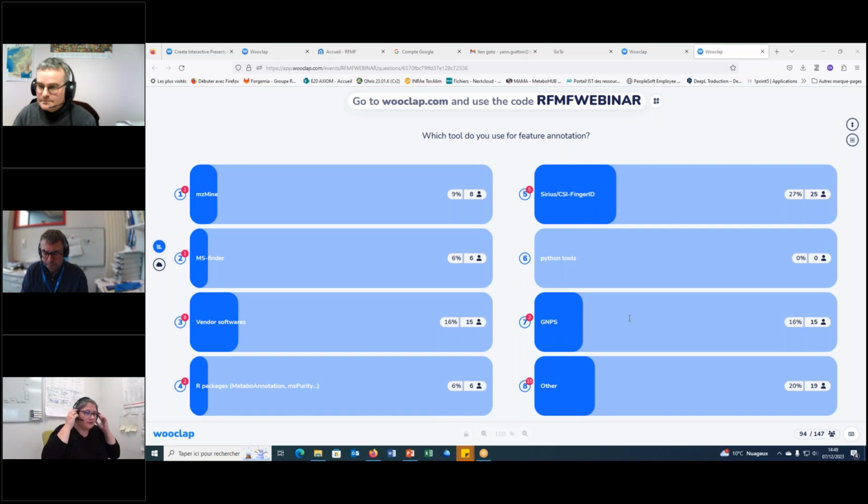Okay, thank you, Yann. So have you other question for Yann? No. Maybe I have one, a tricky one maybe. You've presented us a great range of data processing software. What starter pack would you recommend to people just starting out in mass spectrometry data annotation?